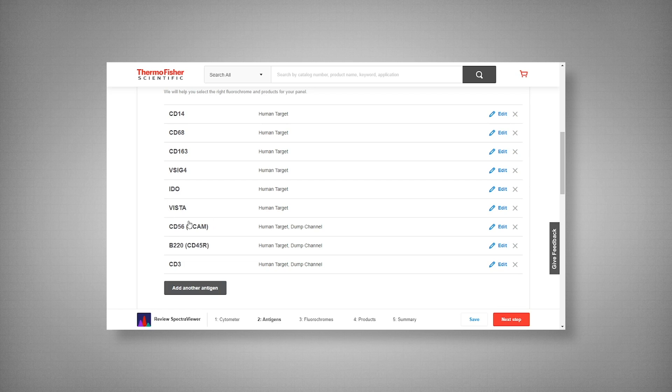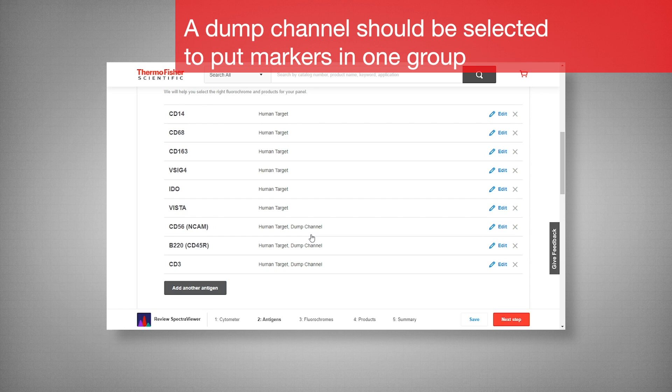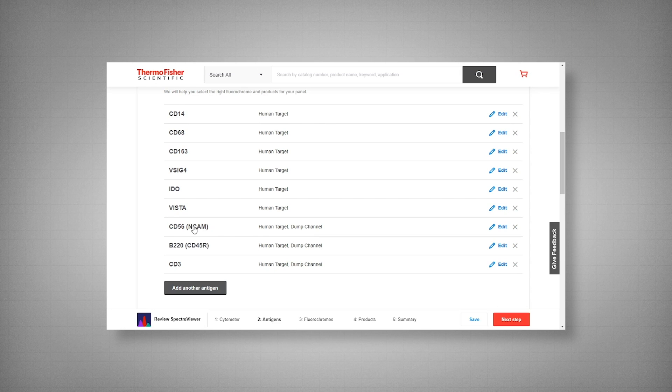Now another great feature to highlight here is our dump channel. Dump channel is for using the same fluorophore on your unwanted markers. In this case we have CD56, CD45R, and CD3, which are our natural killer, B cell, and T cell markers respectively.